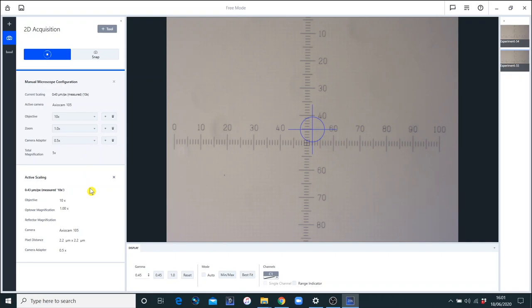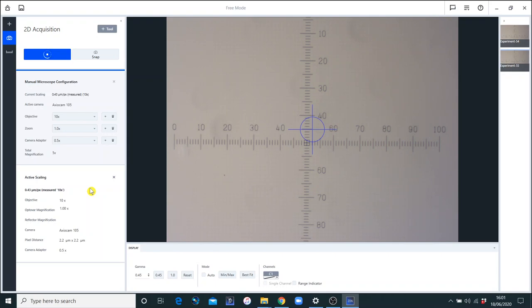So now we can also draw some conclusions about the minimum pixel width and how many pixels we need to get answers. Obviously, we can't measure less than half a micron because our pixels are half a micron thick. But we do have a calibration for the 10.